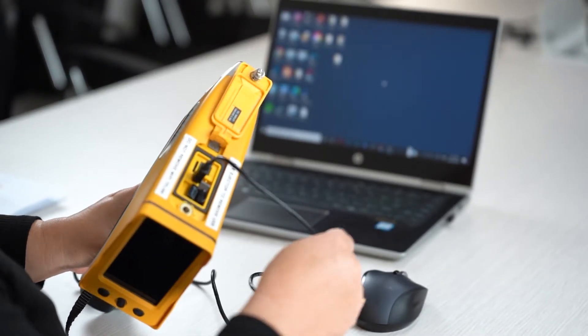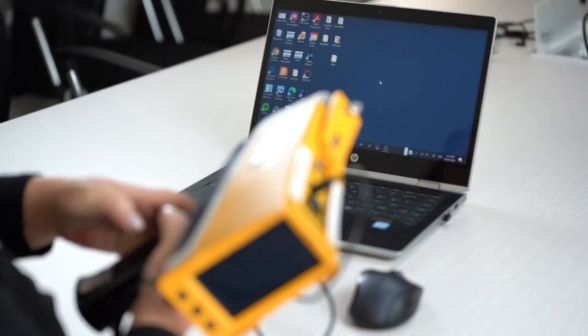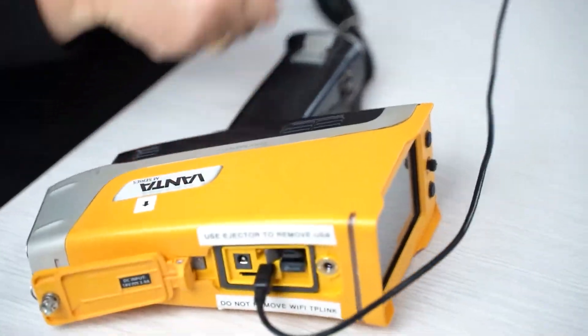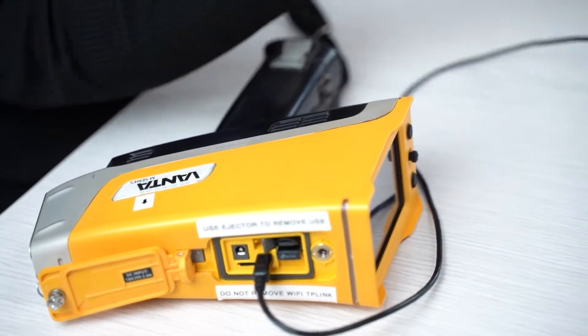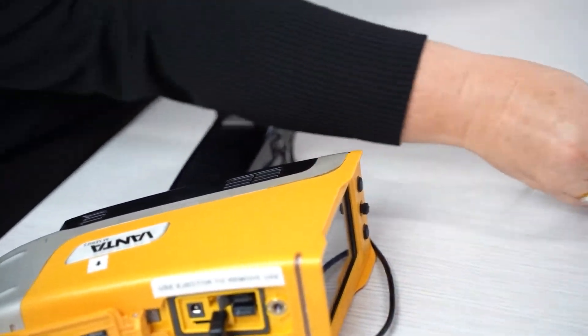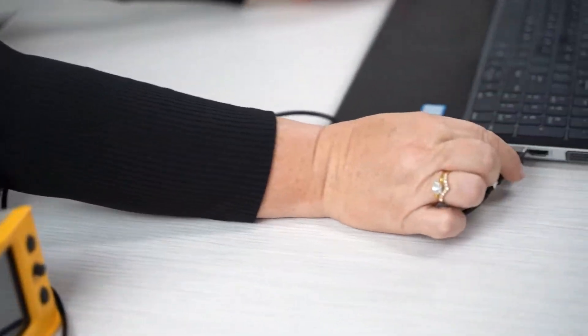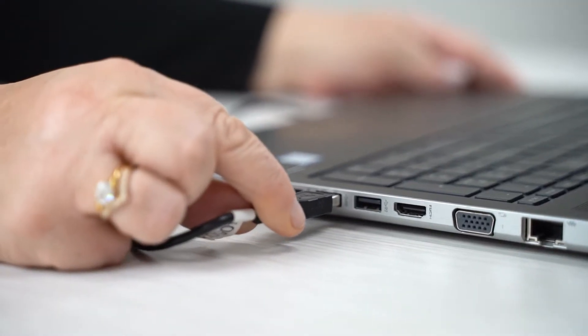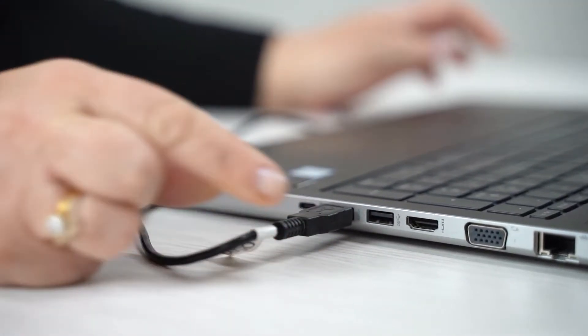There we go. And then the other end needs to be connected into the PC.